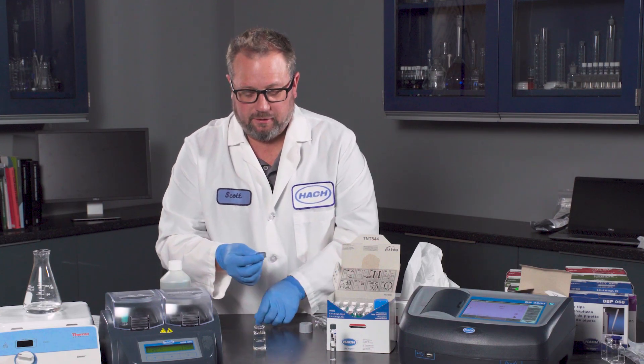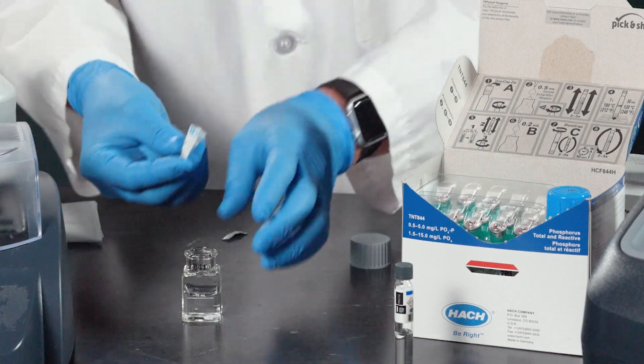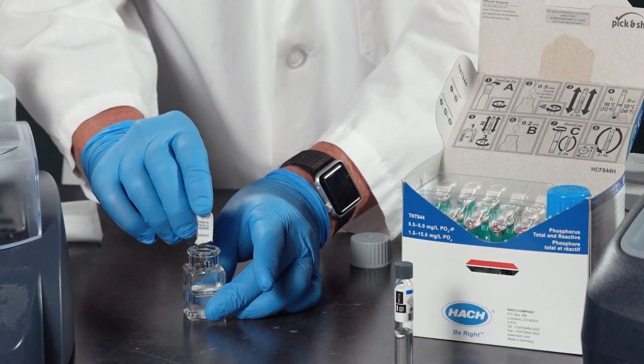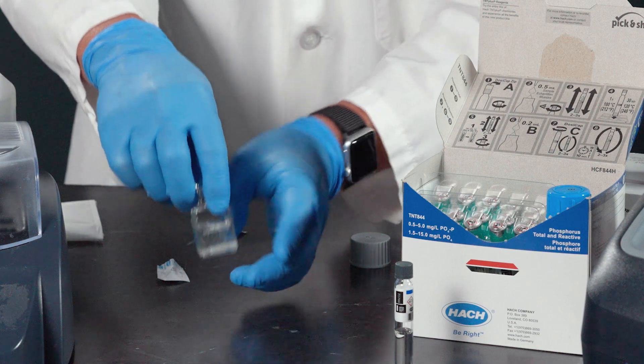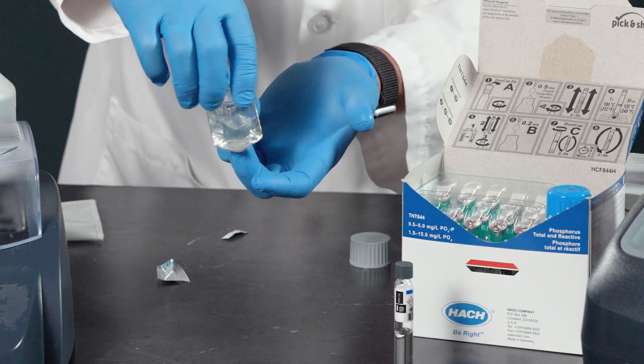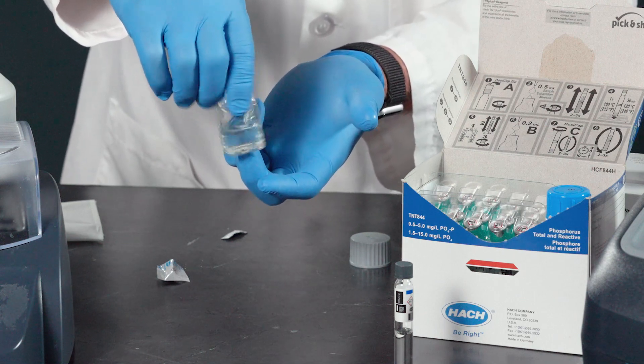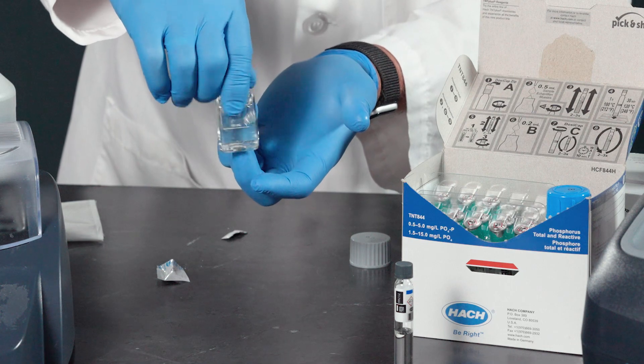Open up the powder pillow, pour it into the sample, do the swirl, and then allow this to react for three minutes.